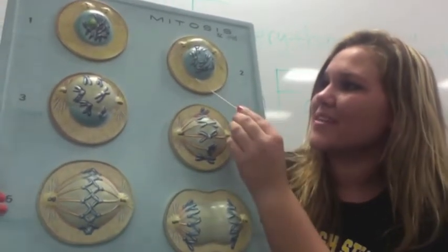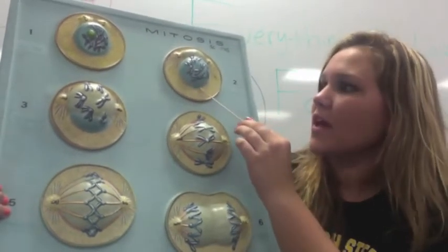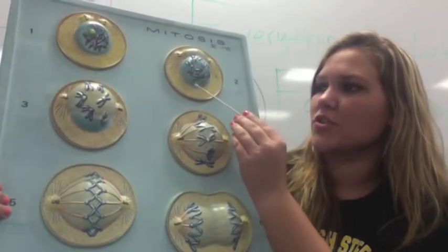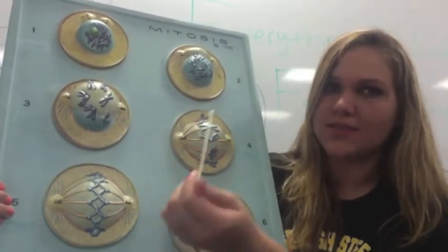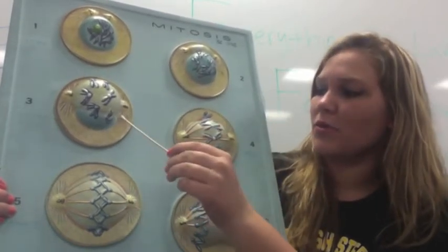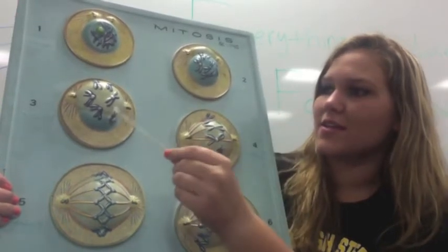All right, so this is the early phase of prophase, and during this phase is where the chromosomes are starting to position—P, position—in the cell, and they're getting ready to be pulled apart by the spindle fibers. So this is early prophase, and this is late prophase.